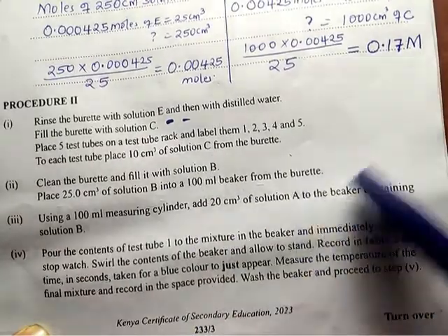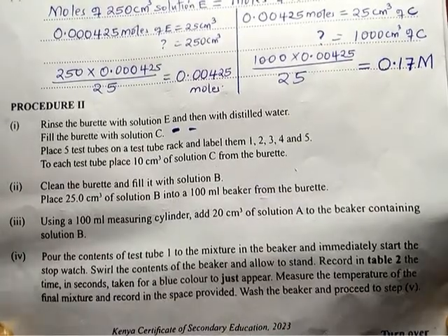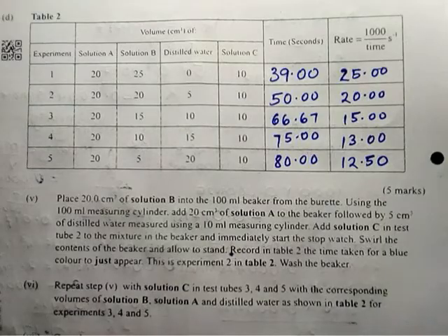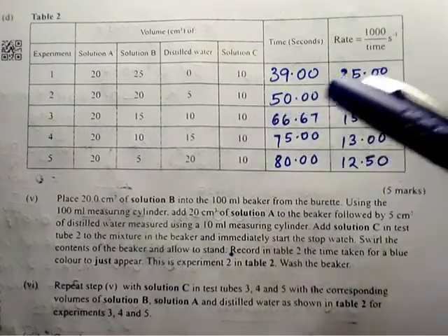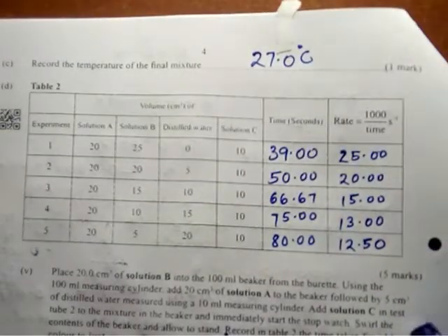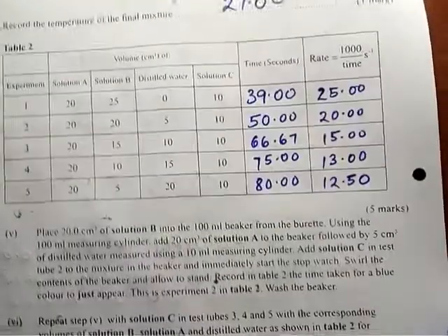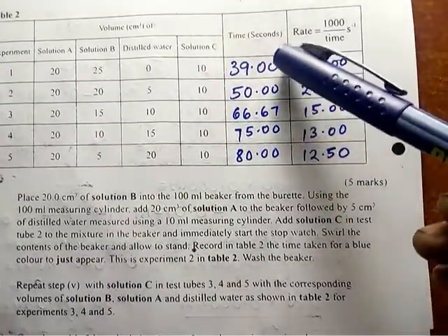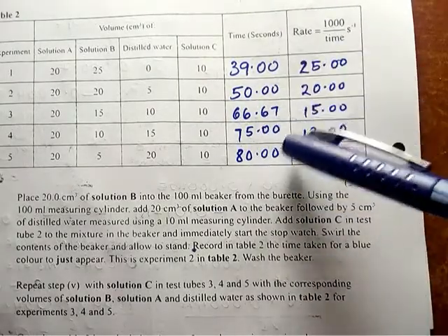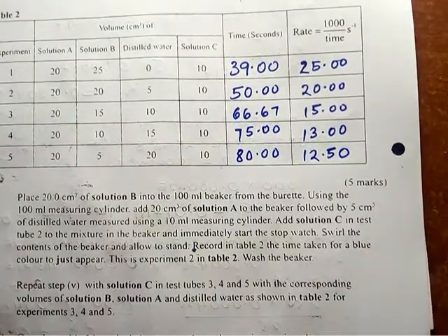So here, students are required to just follow the instructions, and there's no big deal here. After following instructions carefully, this is the table I have come up with. The final temperature in mine was 27. Remember to use 1 decimal place for temperature, and time in seconds you can use 2 decimal places like I have used. Consistently, the table should be complete, and use the decimal places consistently for you to score all of the marks.